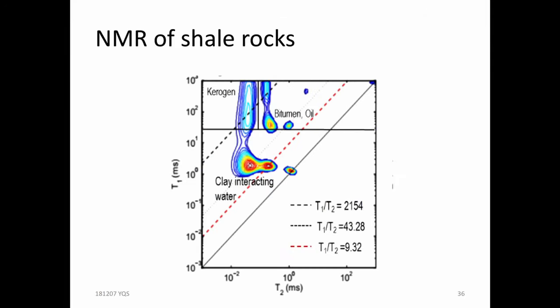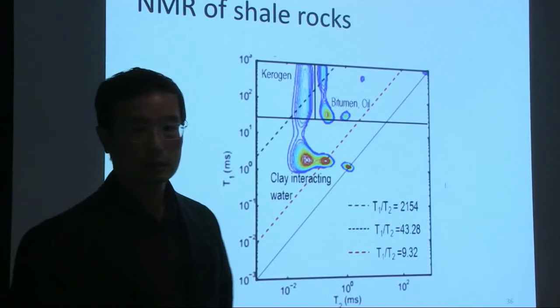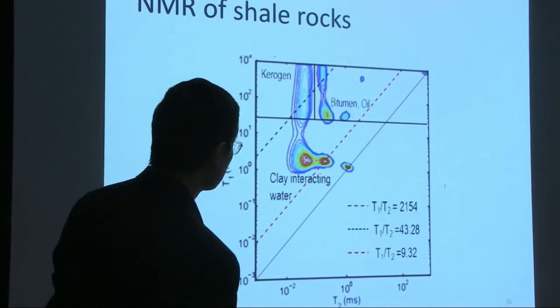And this is done at a lower field that is compatible with the logging tool. They're typically much lower field. This is done at a much higher field, just trying to separate these signals more so that we can quantify them better. So this is done at 9 Tesla magnetic field, much higher field. But it's for the laboratory NMR. This is quite a standard instrument.